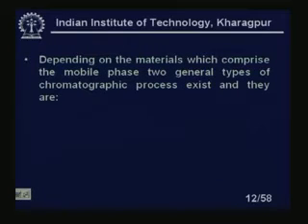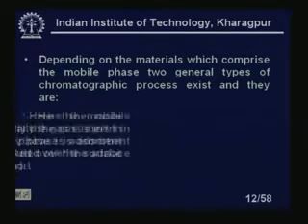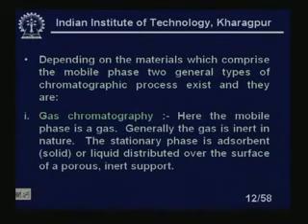Depending on the material which comprises the mobile phase, two general types of chromatographic process exist. The first is gas chromatography.